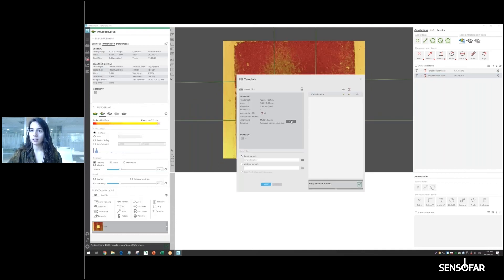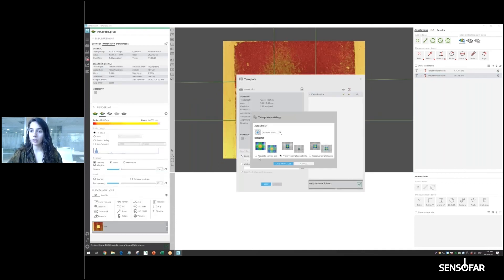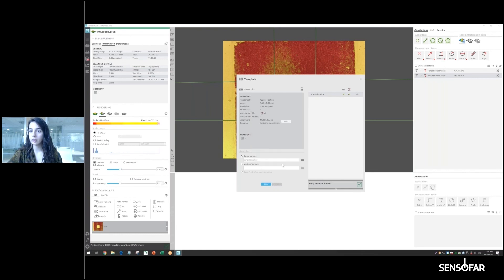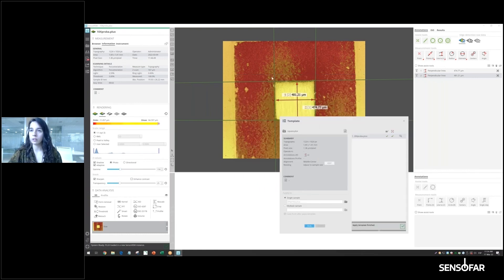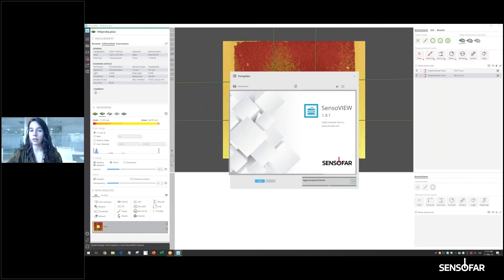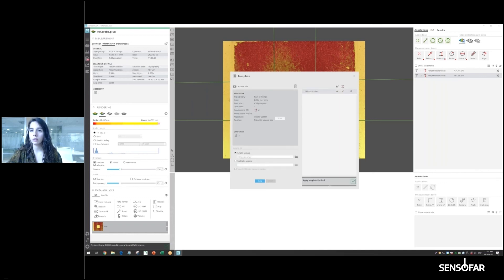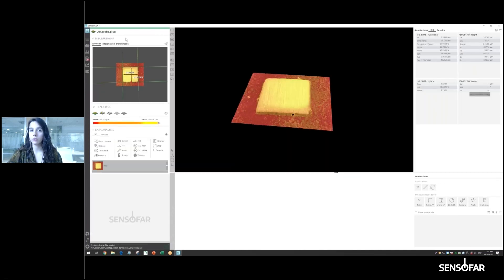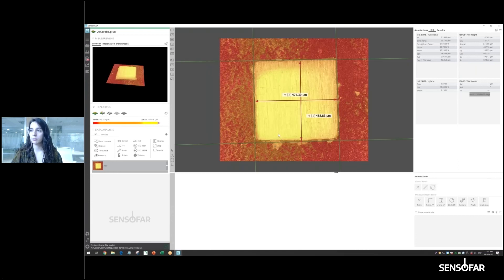In those specific cases, if we use 'Adjust to Sample Size', the proportion adapts to the new pixel size, giving the correct dimensions. Running it now, it works out perfectly.